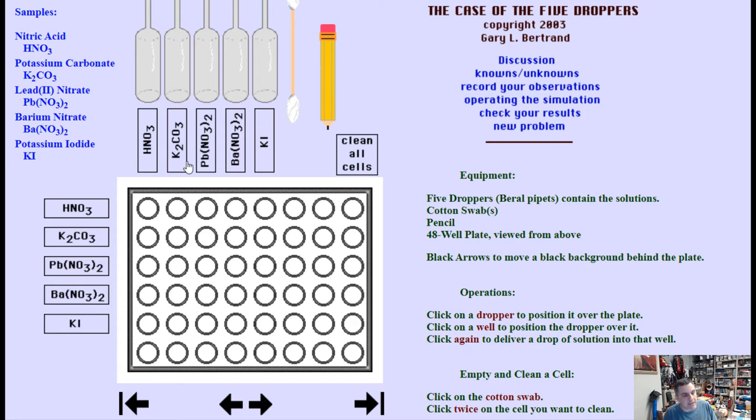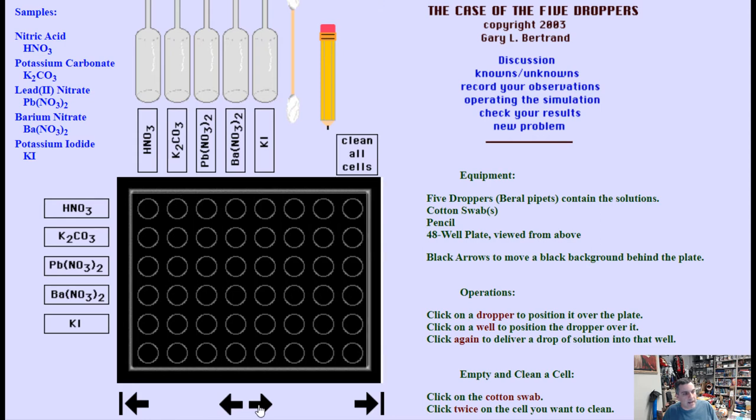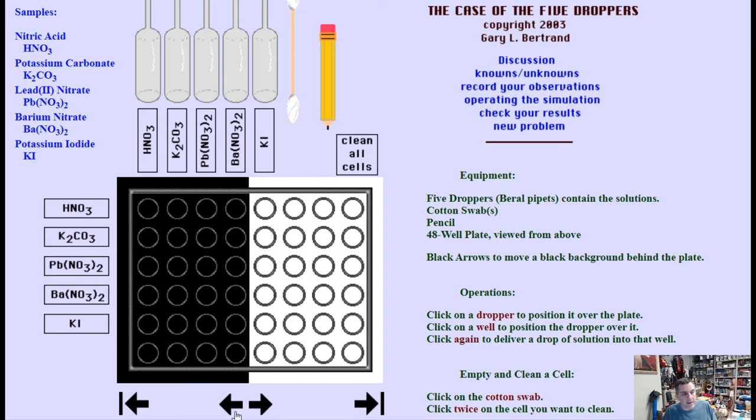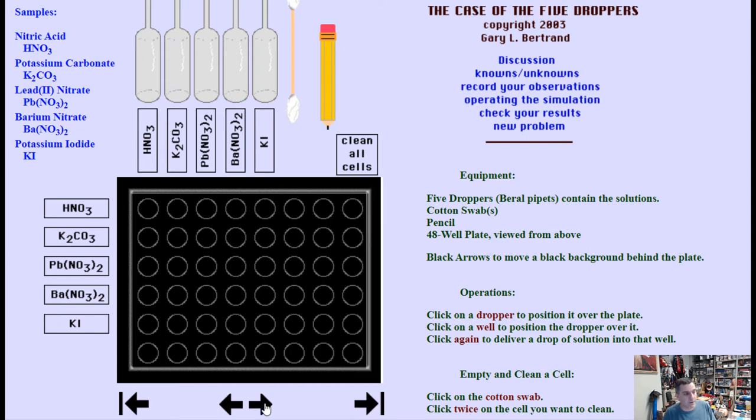First thing you want to do before anything else, and this kind of caught me the first time, is you want to use these black arrows here and slide a black background behind the well plate. What that lets you do is if you form a white precipitate, it lets you see that color against a black background. If you leave it with the white background, you're not going to see those white precipitates and you're going to get confused real quick.